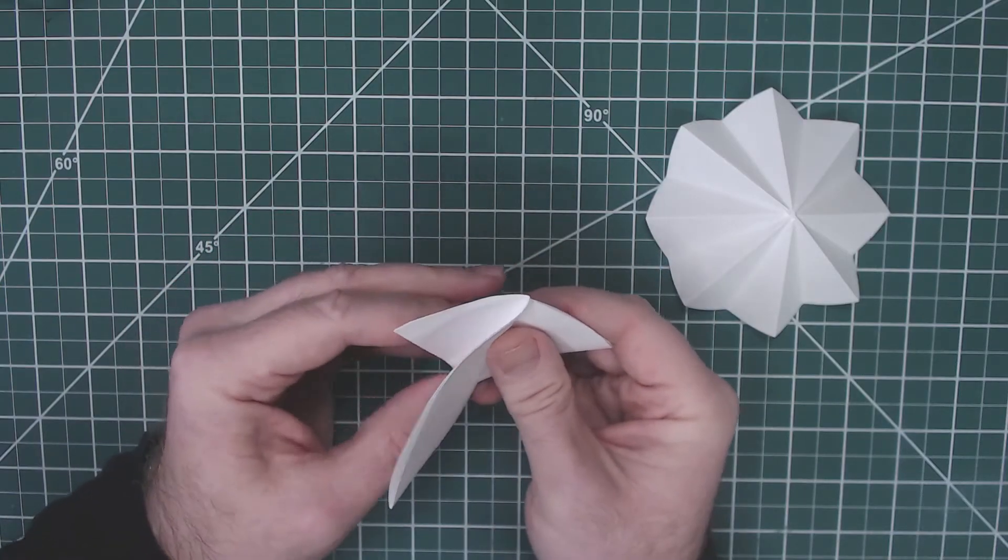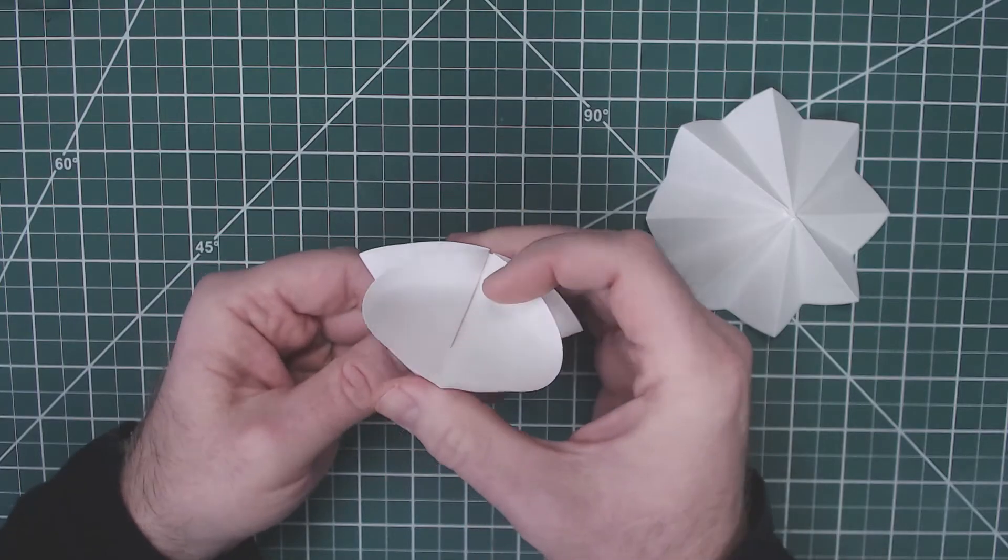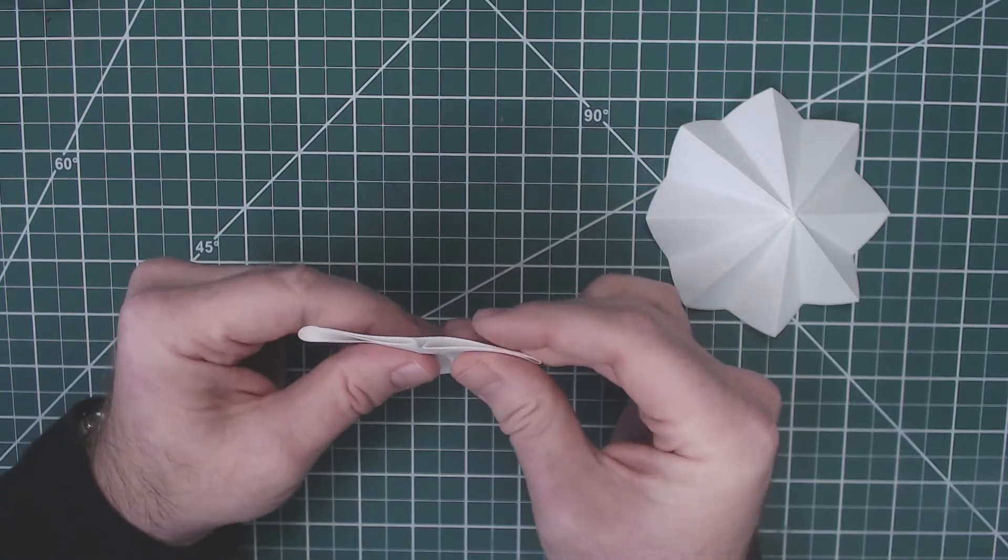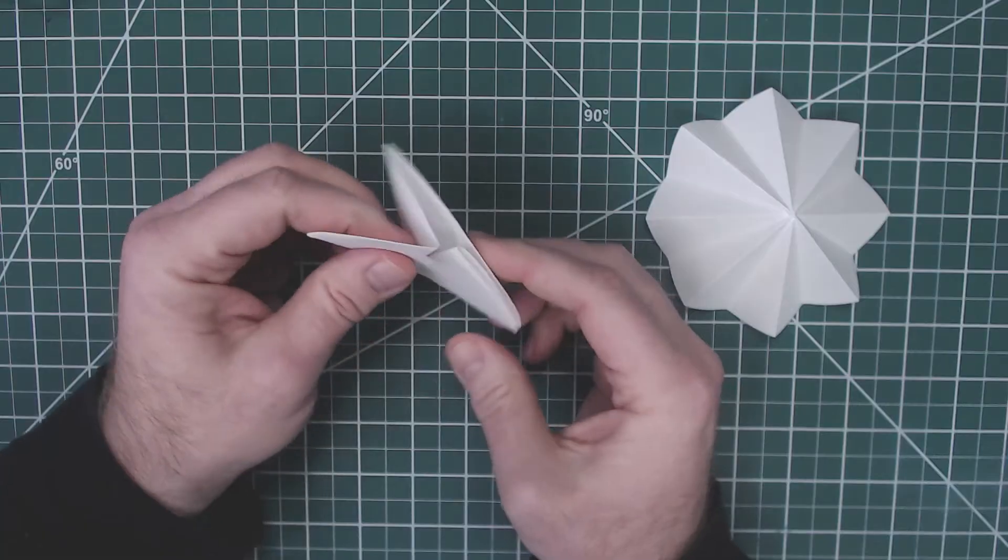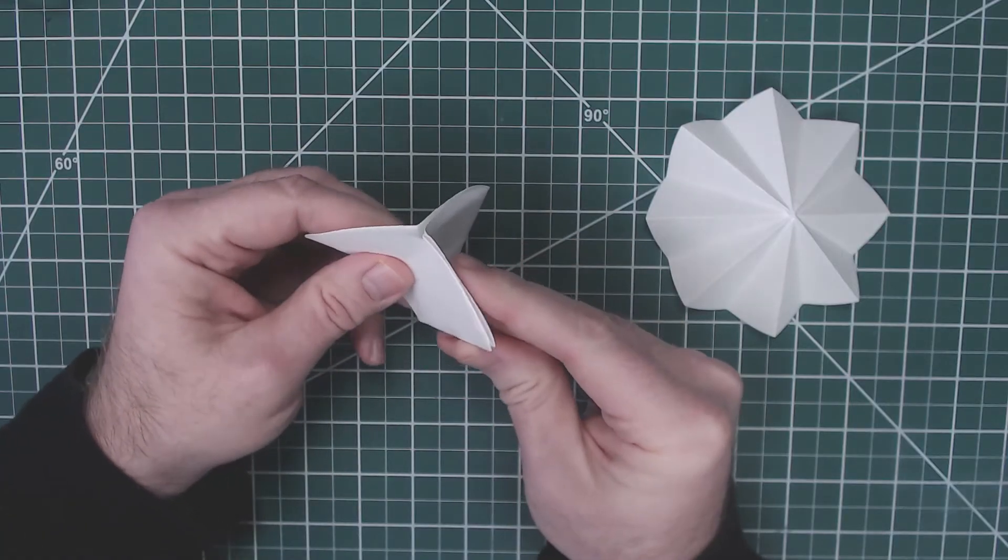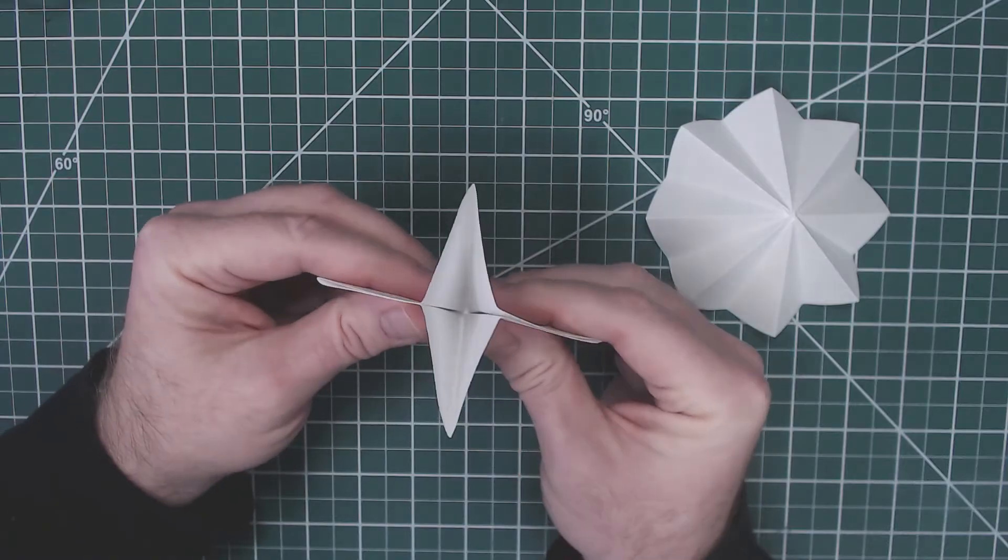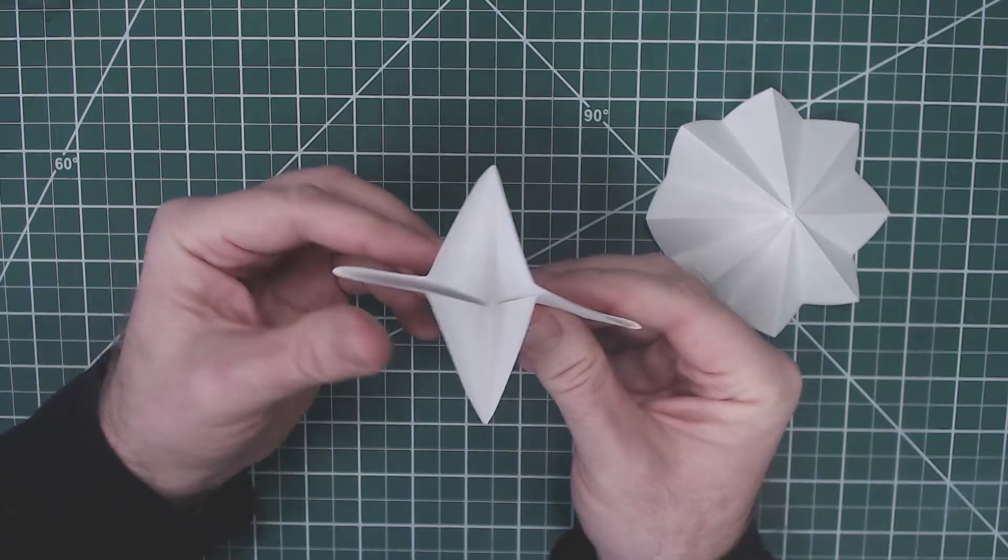The next step is going to be to do the same thing with this side. Line that up with the middle. Now you've got your filter paper that is in quarters. It looks like the old fortune teller game puzzles that you used to do as a kid.